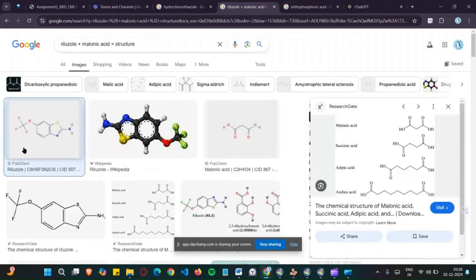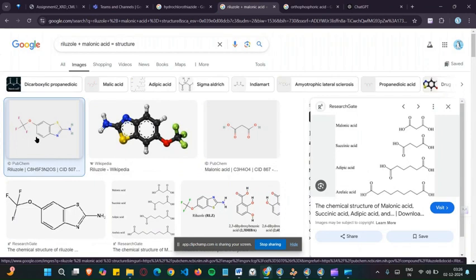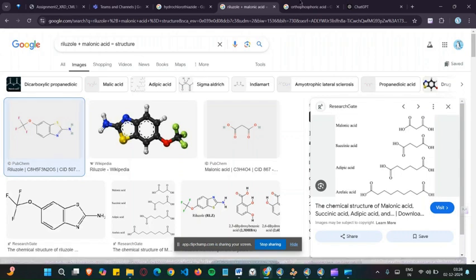If you know the structure and you know that there should be a chlorine, but the system identifies it as sulfur just because they both have very close atomic numbers, such mistakes by the system need to be identified and corrected in order to get a lower R value and reach a structure which is closer to the original structure.